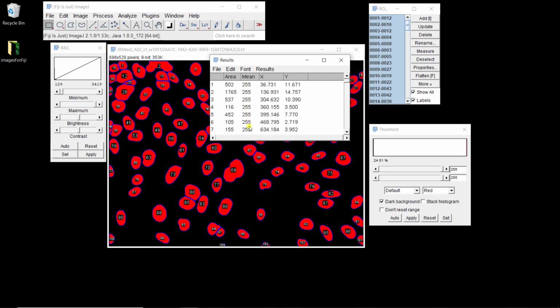So that definitely is not very informative, but it makes sense, because actually what you have here is an image where, as I told you, it's a binary image. It's either 255 or 0 if you're in the nuclei or in the background. So in the nucleus, the intensity that is observed is always 255. So then the average intensity is 255. What would make more sense is to have the average intensity in the original image. And this is also possible. So let's just close this one.